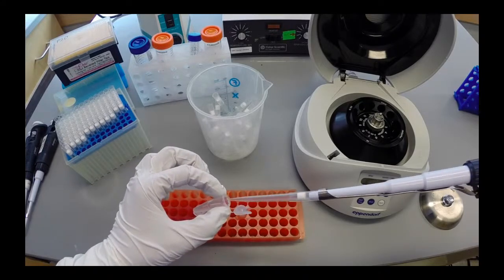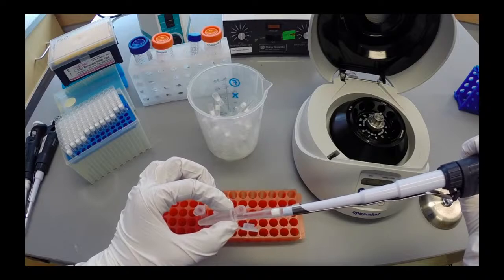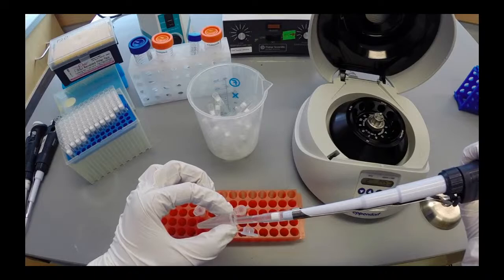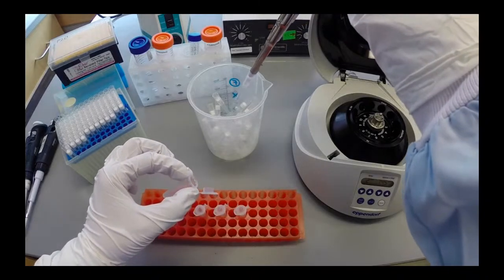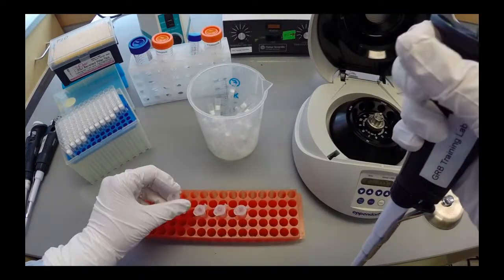Place the tip at the bottom of the tube on the opposite side of the pellet to avoid disturbing it. It is not important at this point that all solution is removed. Just get as much as possible. Expel the tip with the solution inside into the discard bucket. Repeat this process for all remaining samples.